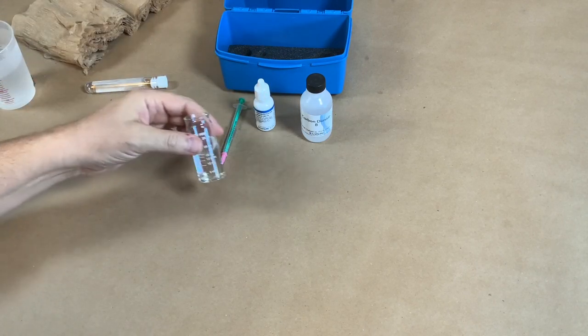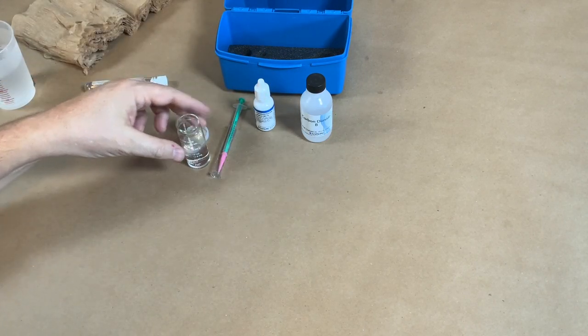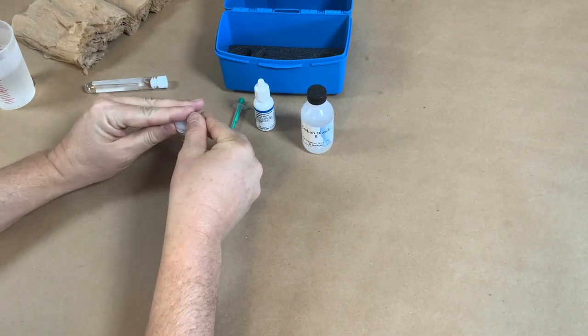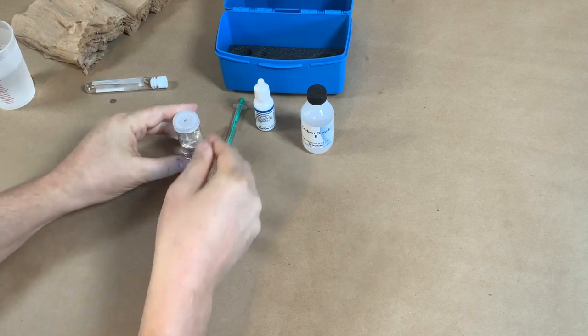The next thing we're going to do is put the cap on here. So there we go, our plastic cap is on there, but it has a little hole in it. And then with this reagent, the carbon dioxide B reagent, I'm going to open that up.